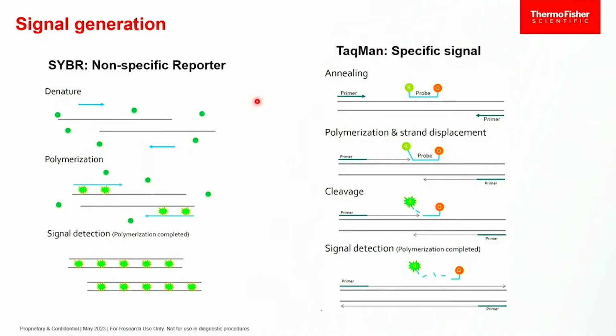And we do that spatially in Sanger sequencing, where we have a molecule and we look for fluorescence of a nucleotide, and we separate that in space by passing it past our detector in a charged field. If we tried to do that in qPCR, we would see incorporated and unincorporated nucleotides at the same time, and we wouldn't be able to tell the difference.